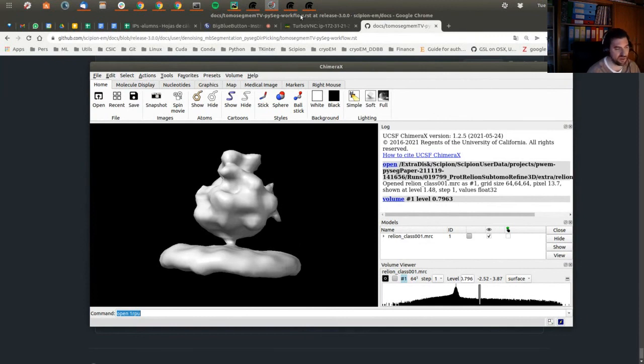This result I was able to obtain helped by Antonio and also by Ana and Patricia from our processing team. Because I'm a software developer, I work with all of this stuff, and I try to learn because it's very transversal work, and we collaborate every day with the structural biologists to develop our solutions.